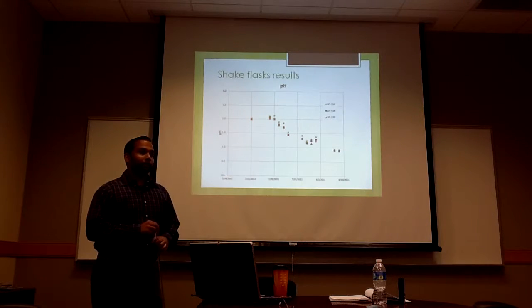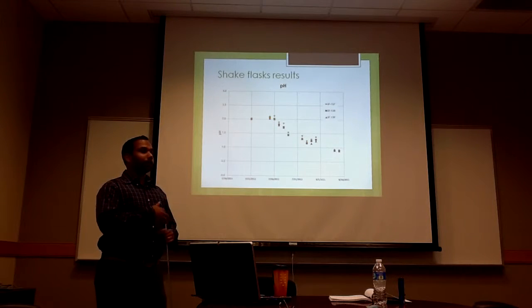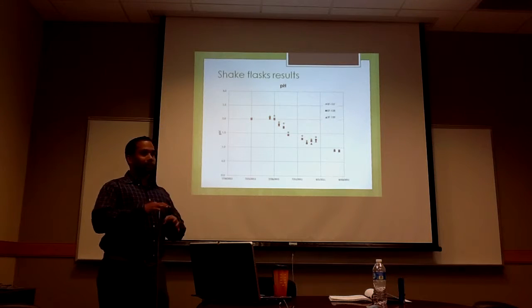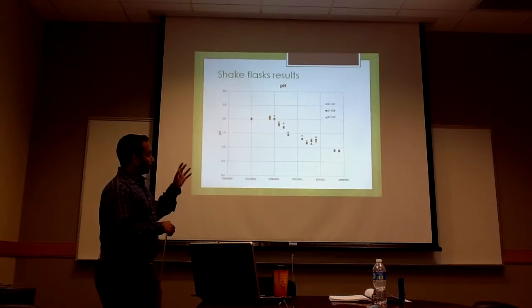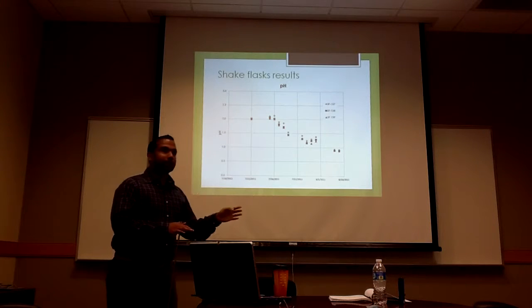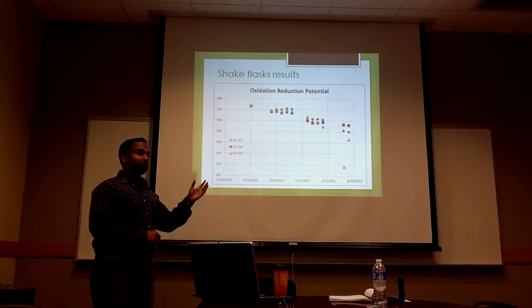And this basically confirms that sulfate ions are being produced within the reaction. So the reaction is taking place, and the sulfur is not affecting the Thiobacillus thiooxidans species, which oxidizes elemental sulfur to sulfate. So this is a check to confirm that the bacterial activity is not inhibited. Another check on this is the oxidation reduction potential.